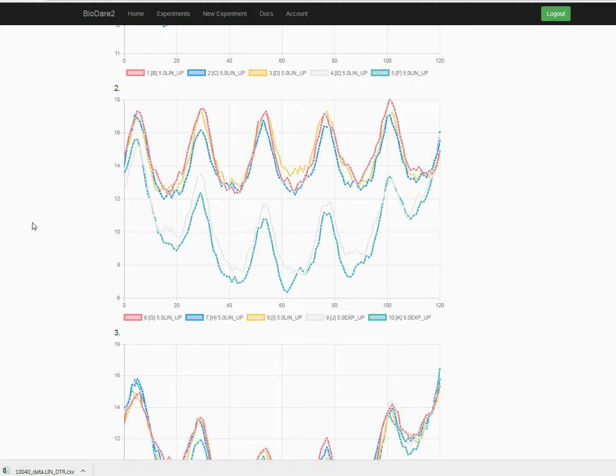To summarize, typically there is no need for amplitude detrending. The methods are resilient to it, and moreover this kind of detrending can introduce artifacts at the edges of the data. However, you should check for the baseline trends. The time series should be relatively flat, with clearly visible oscillations. And you should avoid having curved trends in the data, especially when using FFT-NLS.